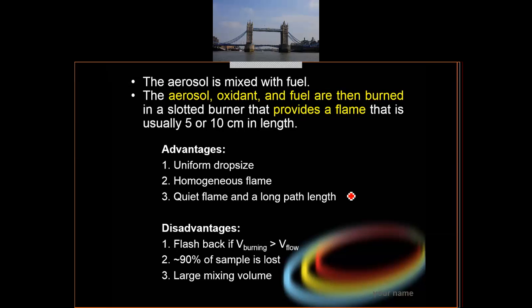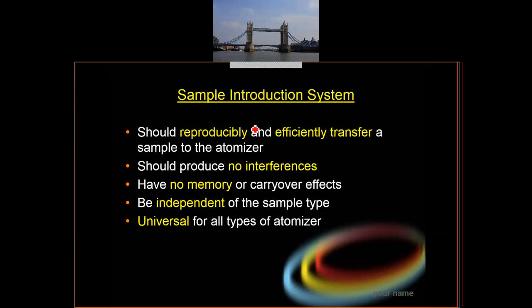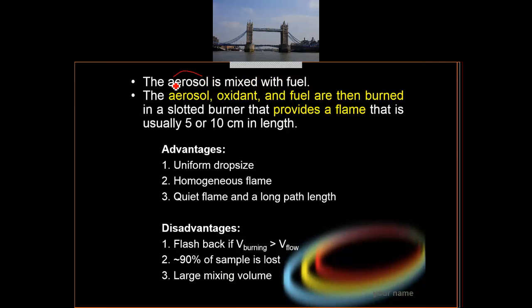Okay, and just like I mentioned before, aerosol. This word aerosol. When it goes up here, when it's been burned, if the sample contains either sodium or magnesium, those elements will not be burned. They will be in ion or atom form, or will be in the aerosol, suspended solid. And then they will still be burned until they become ion.